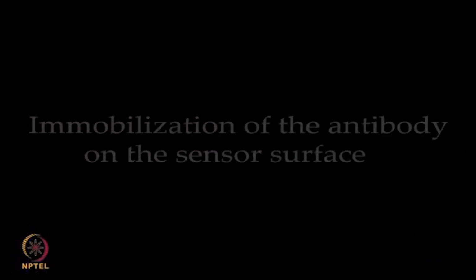Good morning one and all. Myself Sushilendra Vaidya from Pall Corporation. I am going to give a demonstration on how this BLI technology we can use in quantitation. Now I am going to demonstrate the experiment, the quantitation of the apolipoprotein using an antibody against the apolipoprotein.